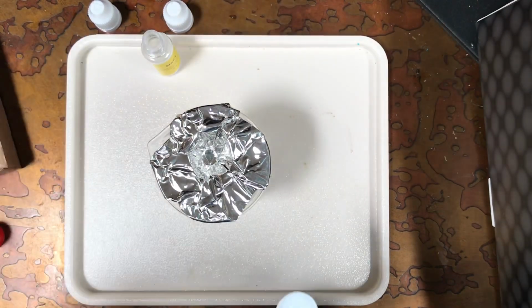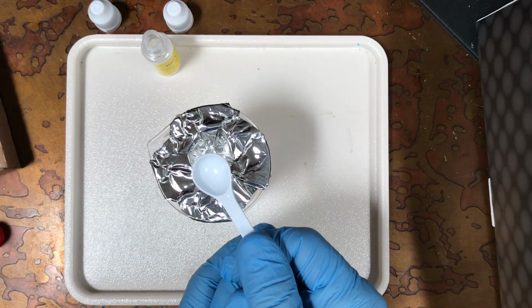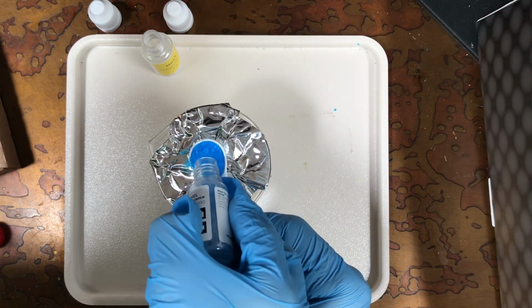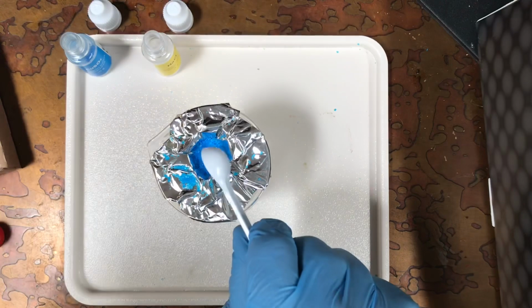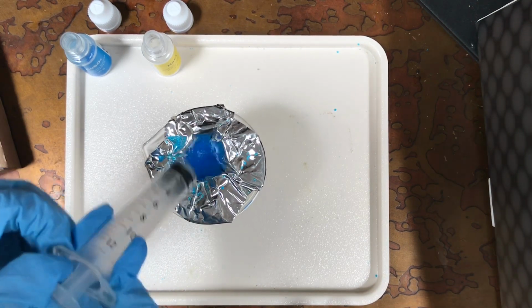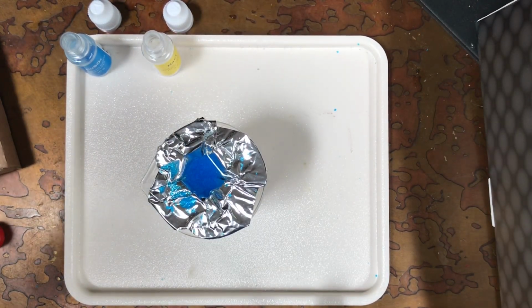First, we are going to add the copper sulfate, which is CuSO4. Next, we are going to add water, which is H2O, as you can well see. Next, we are going to wait and see what reaction will happen.